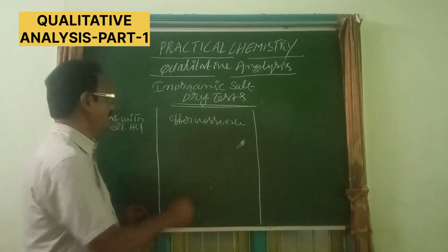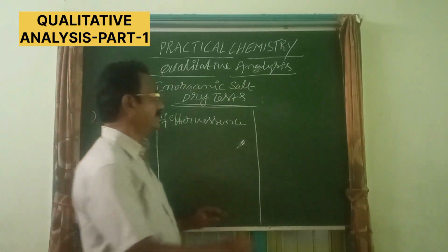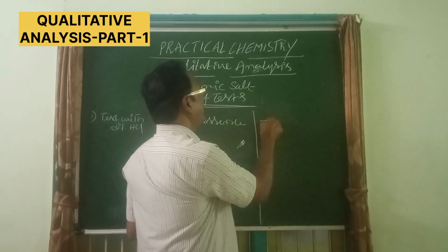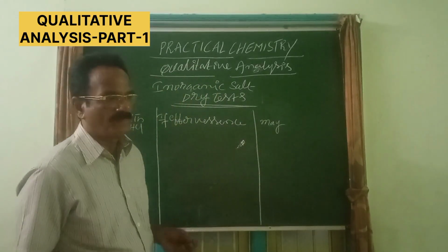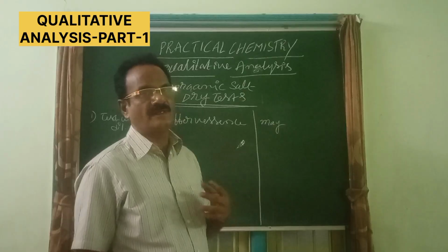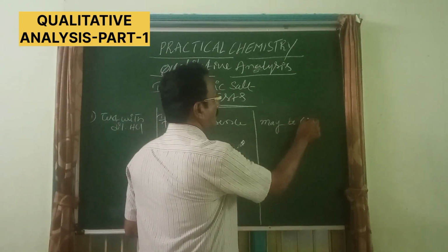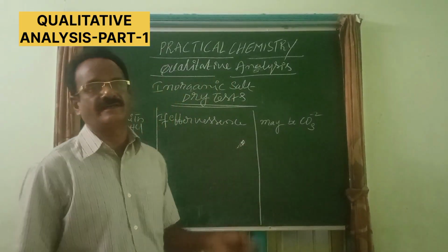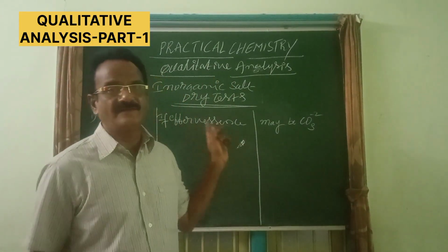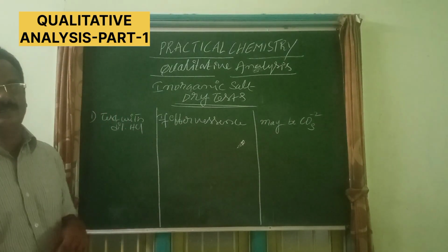Effervescence observed. Okay, if effervescence is there, maybe, since all the tests are useful for identification only, carbonate. That particular salt may contain carbonate when effervescence is observed during addition of dilute HCl to the salt.